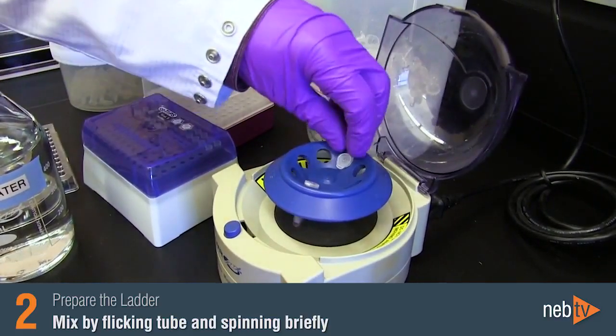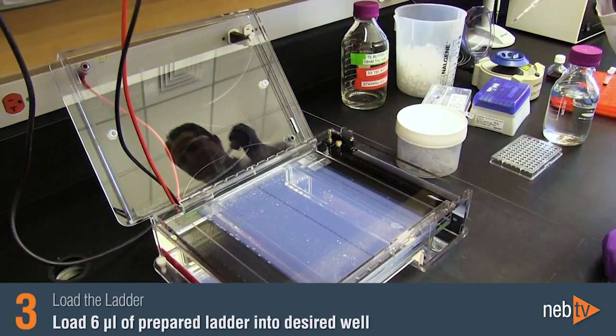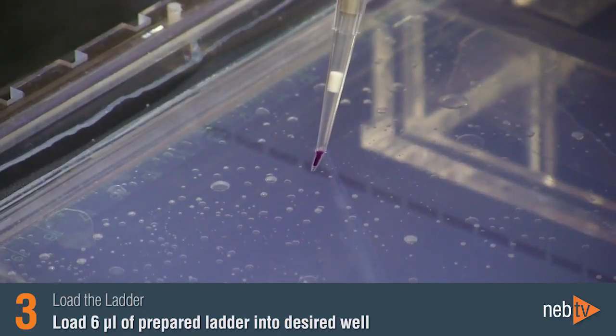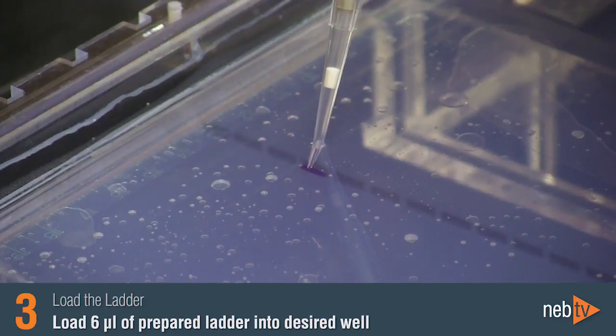The DNA ladder is then ready to load on your gel. Slowly pipette the 6 microliters of the prepared DNA ladder mix into the desired well. Load your prepared samples and then you are ready to run your gel in the appropriate migration conditions.